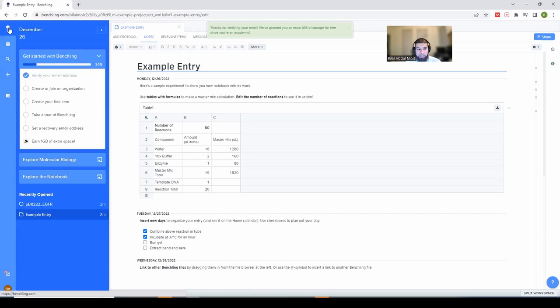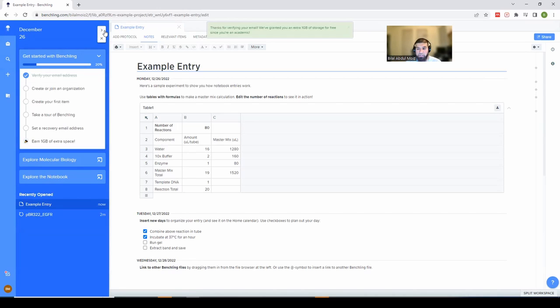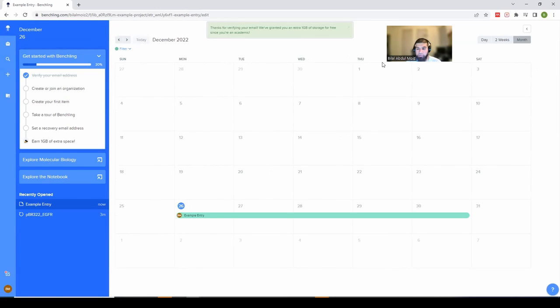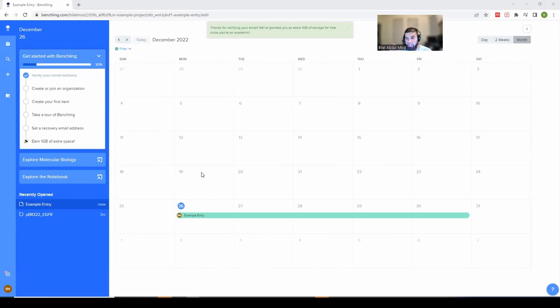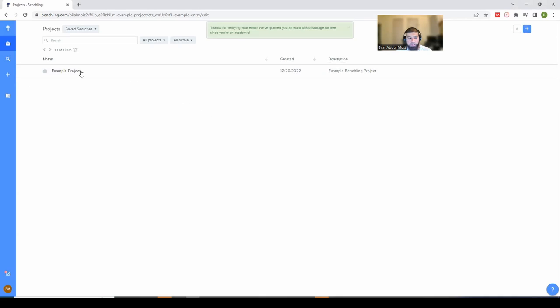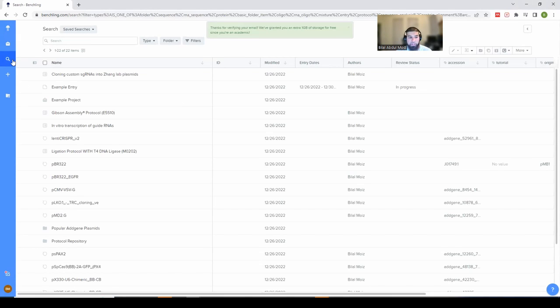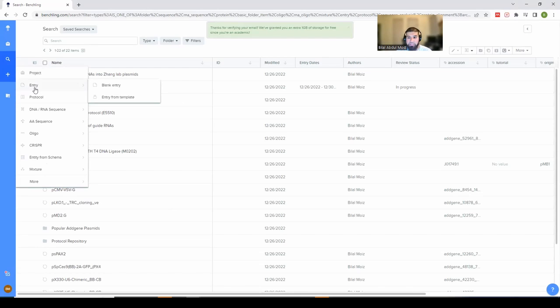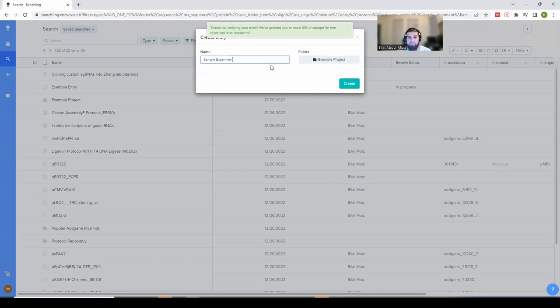You'll notice five tabs here. The first is the home tab, where you can join an organization, take a tour, set up a recovery email, and explore the molecular biology and notebook sections. It's also here that you can access the calendar — hover your cursor on this icon and click it to pop out the calendar and see experiments you have planned. This folder icon is where you'll see all your projects, and the search icon lets you search through entries.